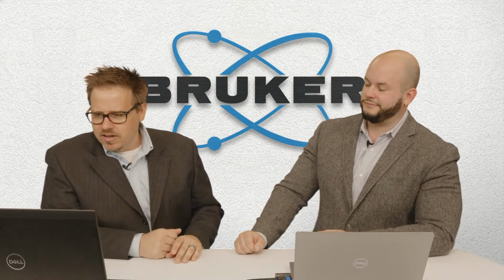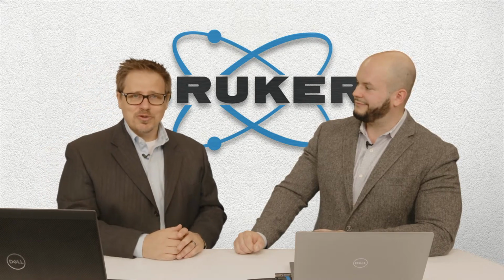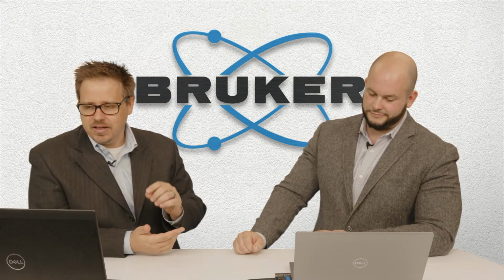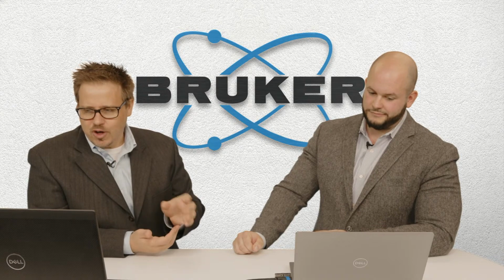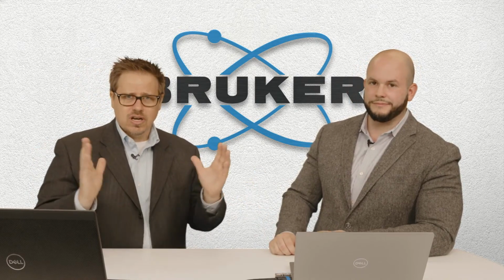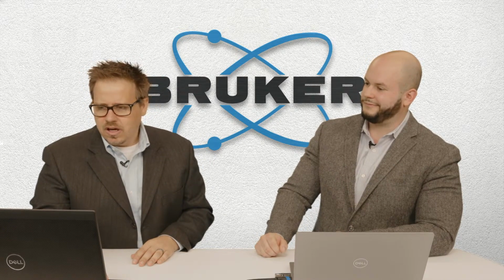And by the way, another answer that we just got in from Kurt Erlacher, one of our scientists over in Germany. Thank you for answering that. With respect to coverage, the calculated pole figure coverage is given by the chi limit that is shown in the harmonic method. The default value represents the lowest measured chi value of all pole figures. So it is just a setting that you can change in the software. That's why it was being limited. And thank you to Kurt for that question.